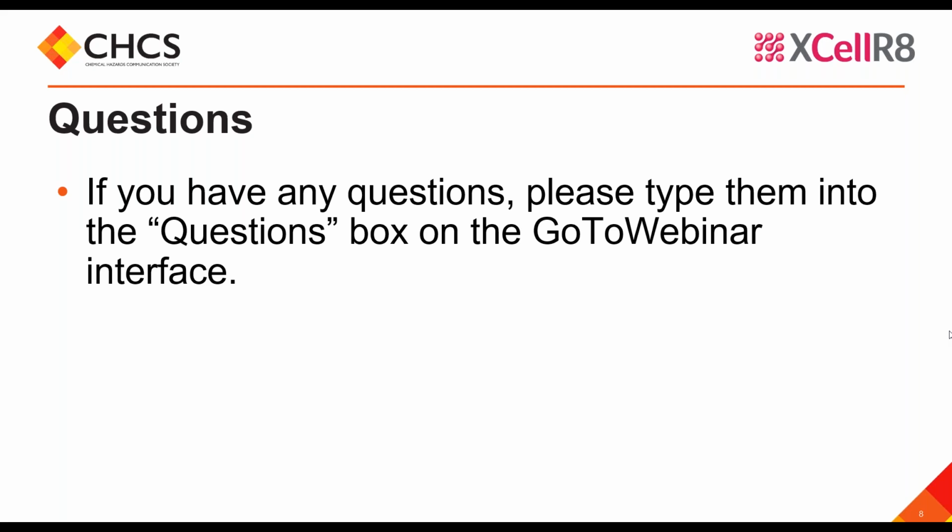So the first question then, Carol. The question here is asking whether or not an accredited laboratory needs to be used to perform the in vitro tests.